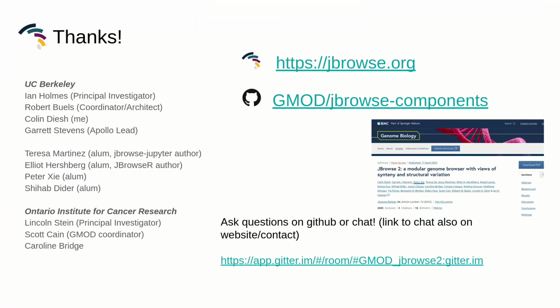So with that, I just want to say thanks, and I'm going to try to do a live demo to demonstrate some of this stuff as well. If you're interested, you can hang on, and I will load up my terminal to continue.